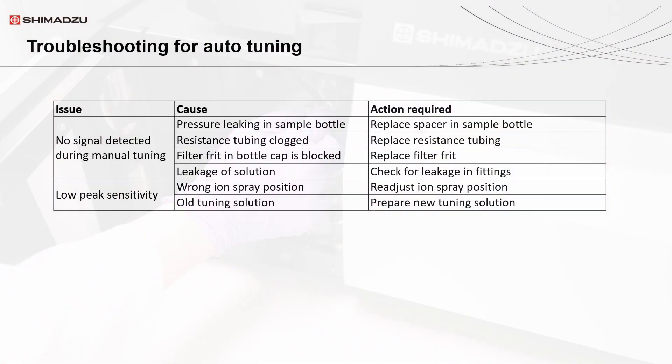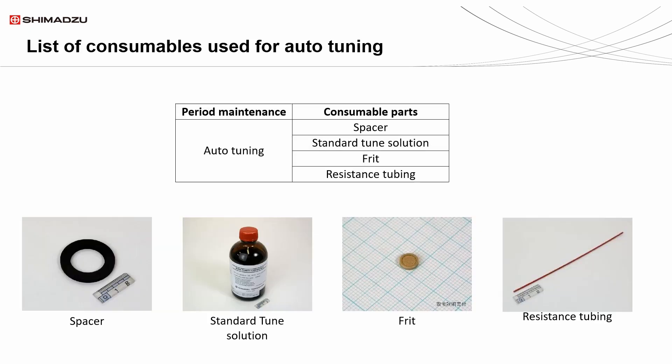Below are some of the common issues that may be encountered during auto-tuning and the solutions to them. Here's the list of consumables that have been used for the auto-tuning maintenance. If you require any of these parts, please contact your local distributor for more information.